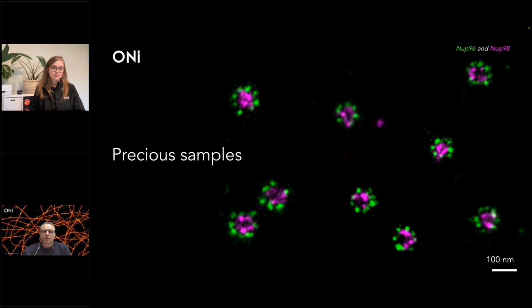And we all know that in a tumor environment, or any cellular environment, it's not only our cell alone there. So what's in the surroundings will influence the behavior of your cell. And that's why 2D imaging, or 2D assays in general, sometimes might not reflect 3D assays. And in this case, if you want to do 3D, like organoids, for example, you can do that.